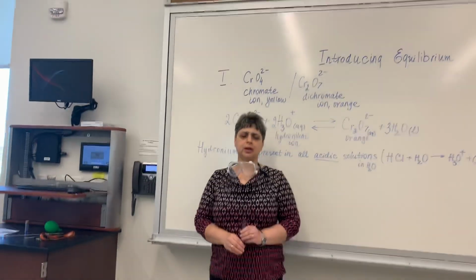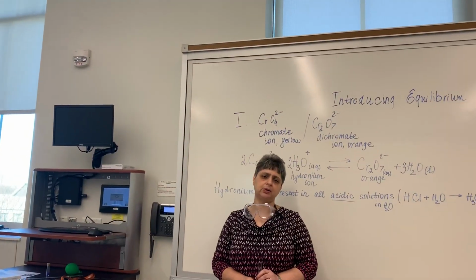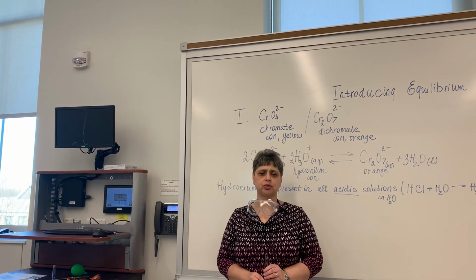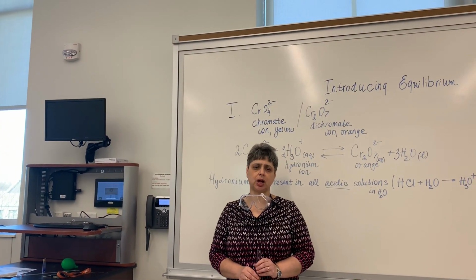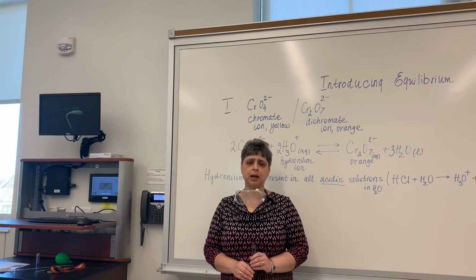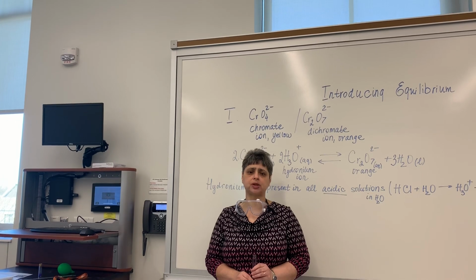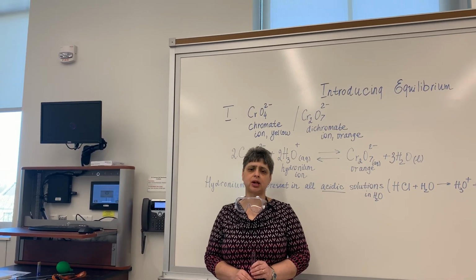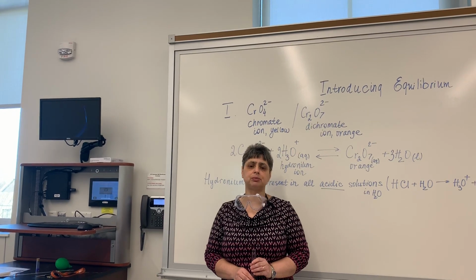Alright everyone, we're once again talking about chemical equilibrium, and this time I'm actually going to show you several reactions described in your lab manual, and we're going to discuss what is happening and how we can apply Le Chatelier's principle to the changes in the reaction mixture's appearance that we observe.